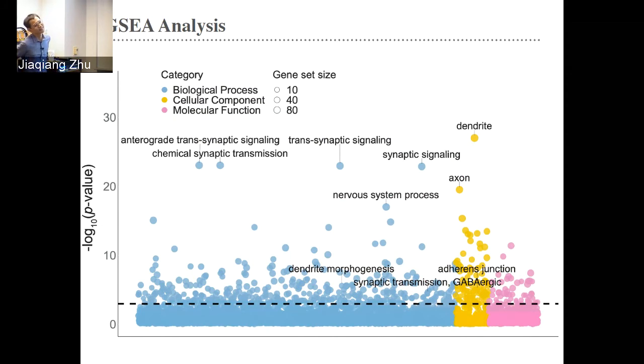Okay. But again, maybe you don't care that much because this is just a point. But if you really wanted to know the functional enrichment, you would want to compare it against a control, against a background. You can permute the spots, and your type 1 error control is pretty good, so I'm willing to believe that this is enriched. But is this actually a different enrichment than what you would get just from what's well expressed? I would assume that with such an analysis, there will be less enrichment terms here. Yes. And you might get specific spatial things, so transsynaptic signaling might strike you more as something that's spatial as opposed to just present.